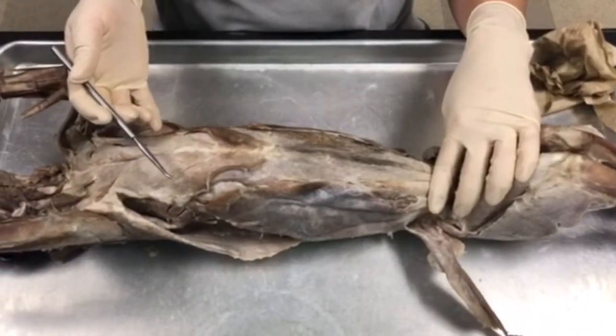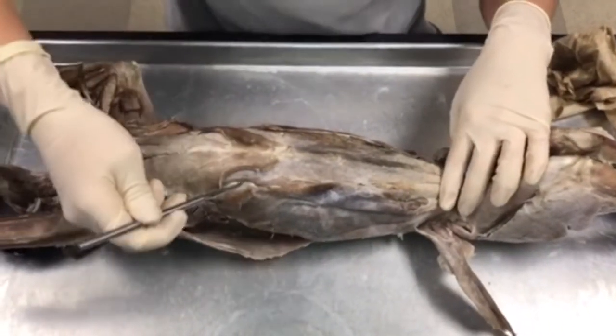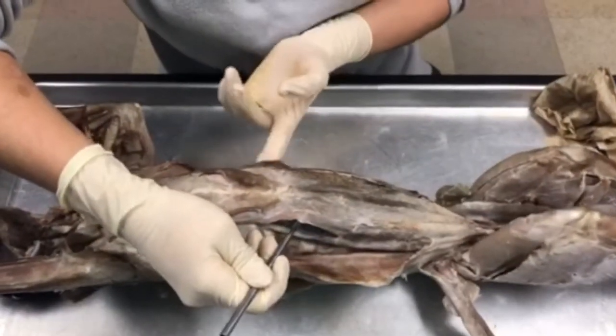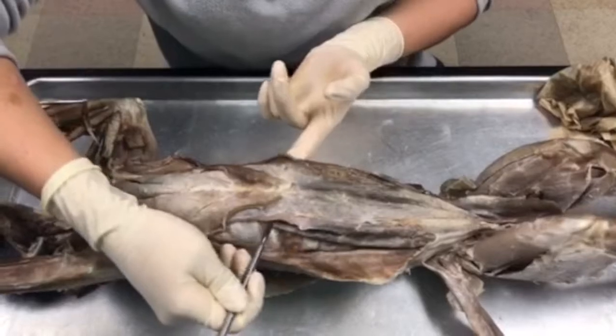We're going to review the muscles of the abdomen for the cat. First, this muscle here, this middle layer, is going to be known as your rectus abdominis.